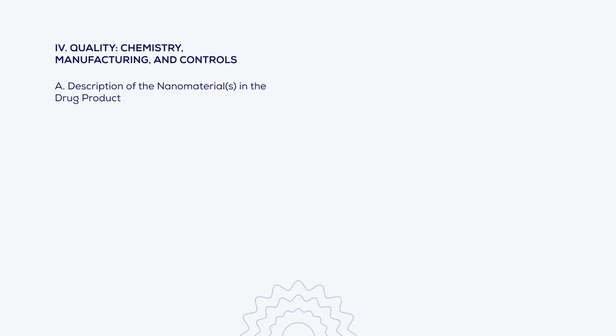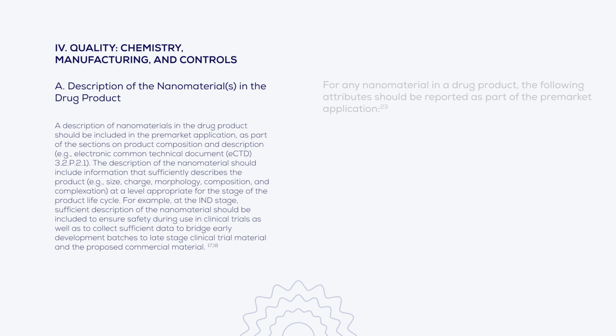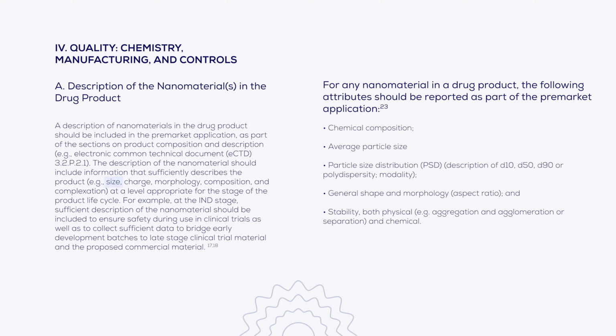production. While nanomedicine regulations are a work in progress, fundamental attributes come up frequently in draft and proposed guidelines. Of note, the FDA has listed physicochemical properties that should be reported as part of the pre-market application. Among this list is particle size, and this is one which is unlikely to disappear from the list of data points that regulatory bodies want to see. Therefore, monitoring LNP size is vital for product development and quality control.